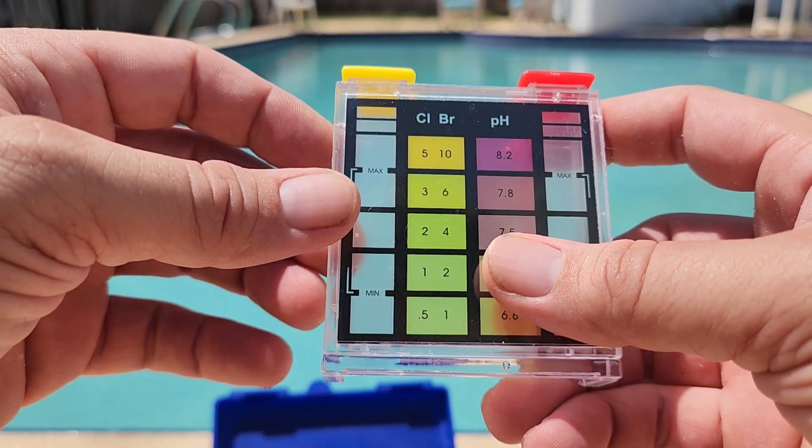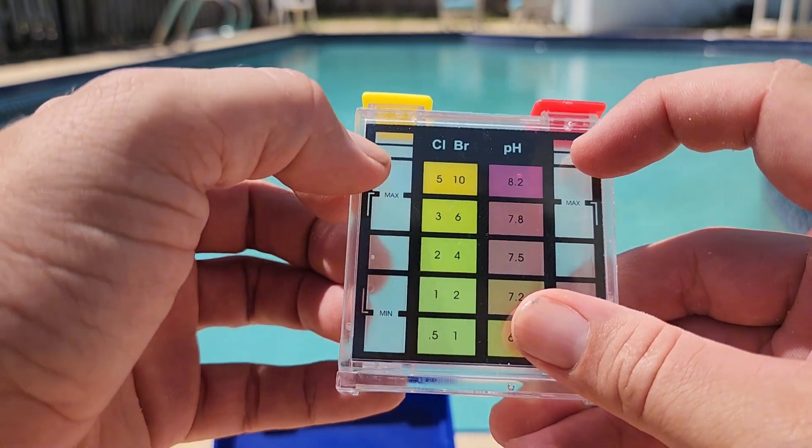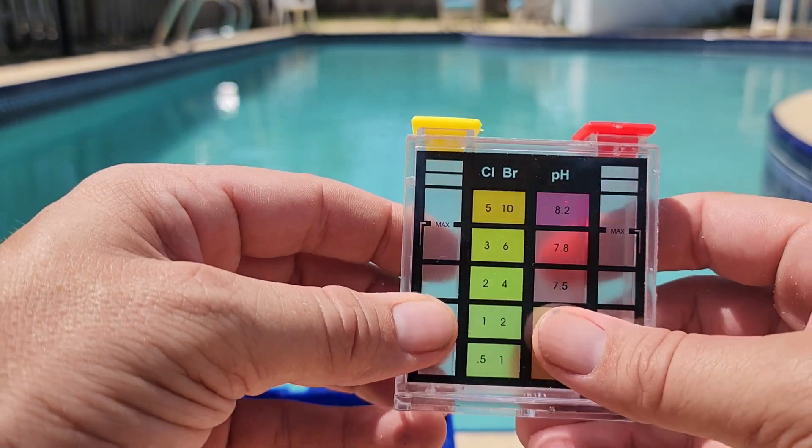What you're going to do is fill this with water up to the little line right here, and then you're going to add five drops of the yellow on the left and five drops of the red on the right. So we're going to go ahead and do that and take a reading.